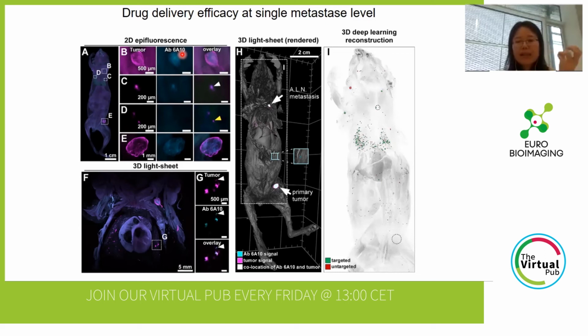which is targeted the CA12 inside of the cancer. So here we use the whole body transparent vDISCO technology to label the tumor cells in one channel, and also the therapeutic antibody we conjugate with a fluorescent dye in another channel. We want to see if there is colocalization in these two channel samples.